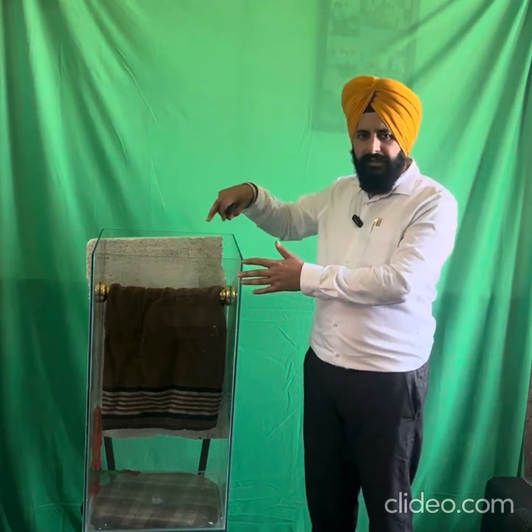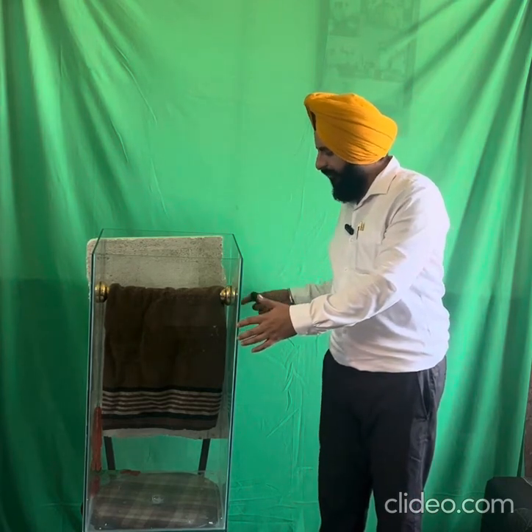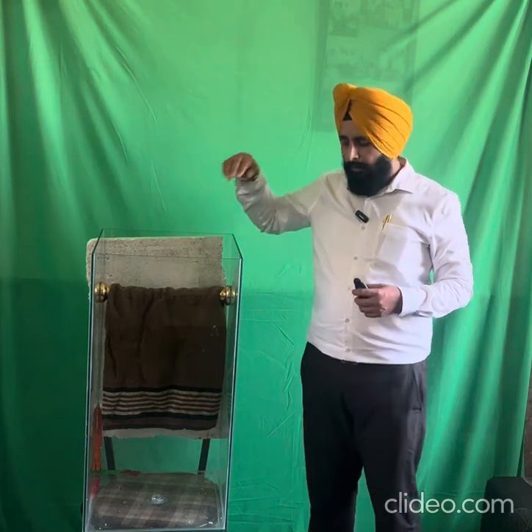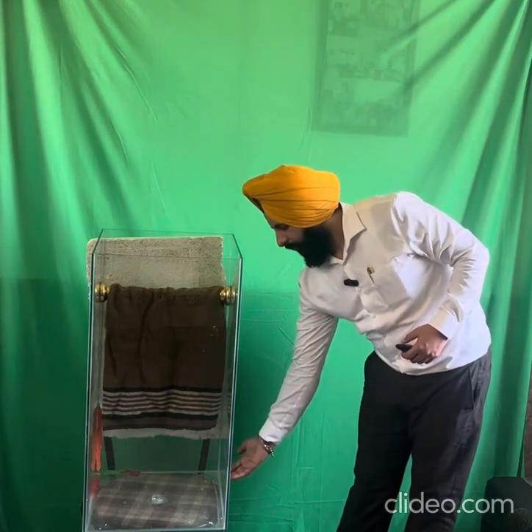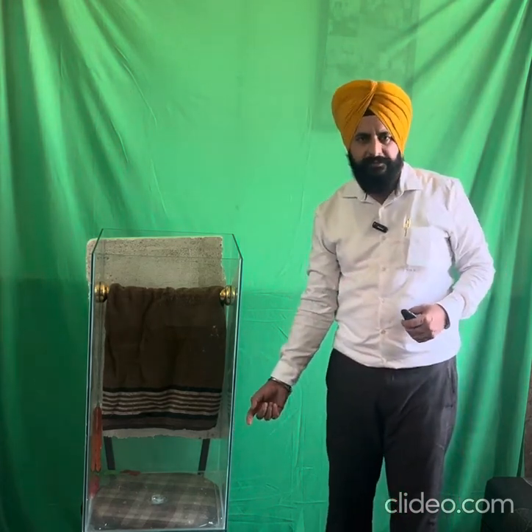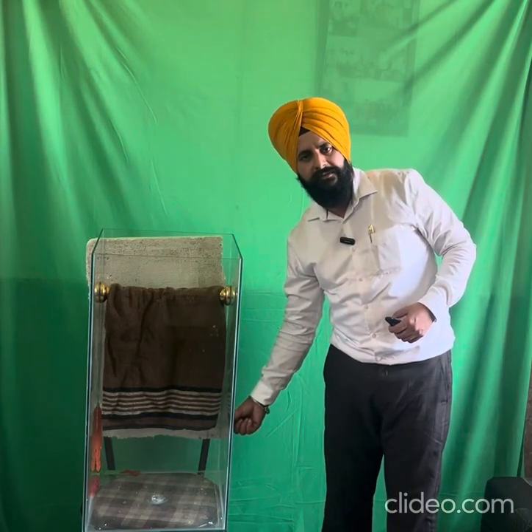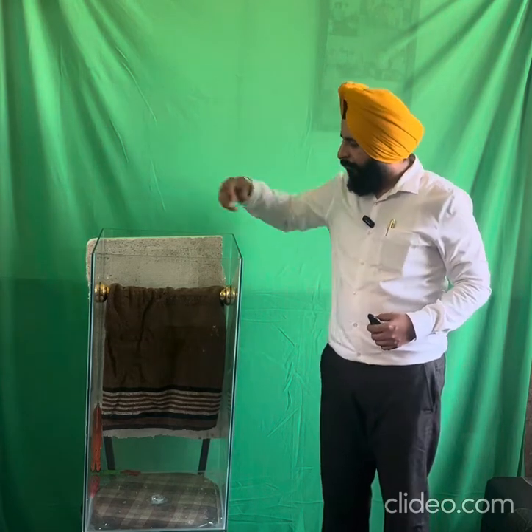This instrument is made of glass, rectangular in shape. The width and length are 40 centimeters and the total height is 80 centimeters. Internally there is a rod where you fix a towel or a rope. The rope height should be 20 centimeters above the water level. You fill water up to 17 to 18 centimeters, leaving a gap of 2 to 3 centimeters between the water surface and the lower part of the towel or rope.